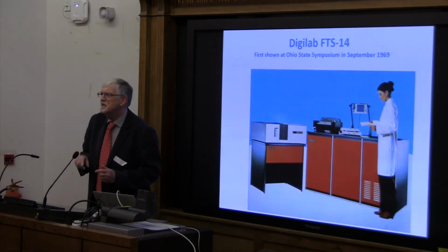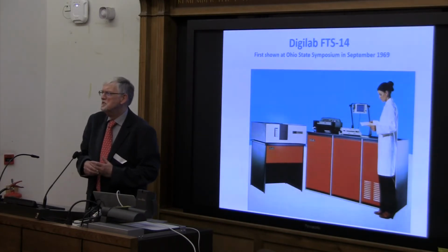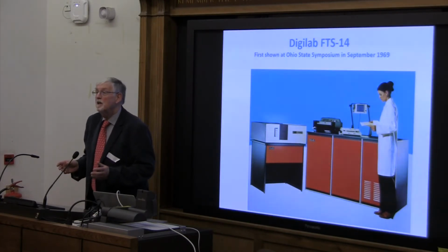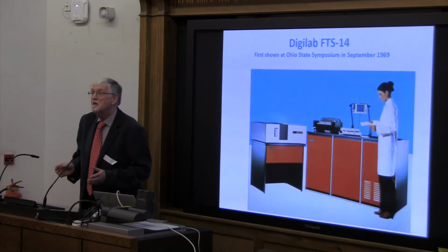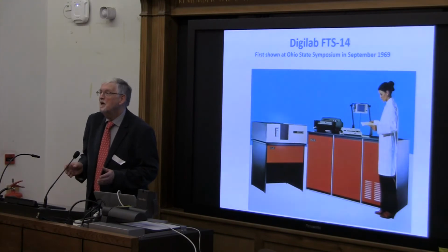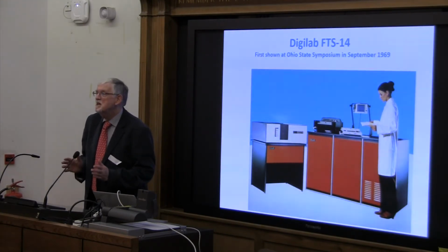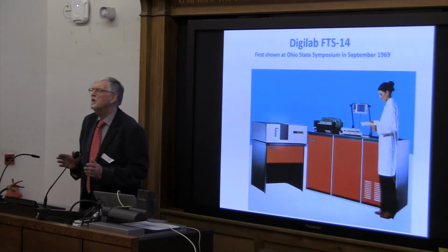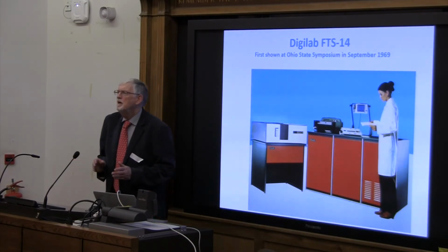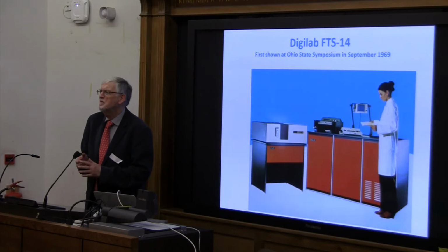We realized that something was different in Ohio than in Cambridge, Massachusetts, where the instrument was, in that we never saw that when it was set up in Cambridge. The instrument had an AC power supply, and so we had to somehow get a DC source power supply, which had, what was it, 3.5 volts on it. All electronic shops were shut, including the one in the physics department at Ohio State.